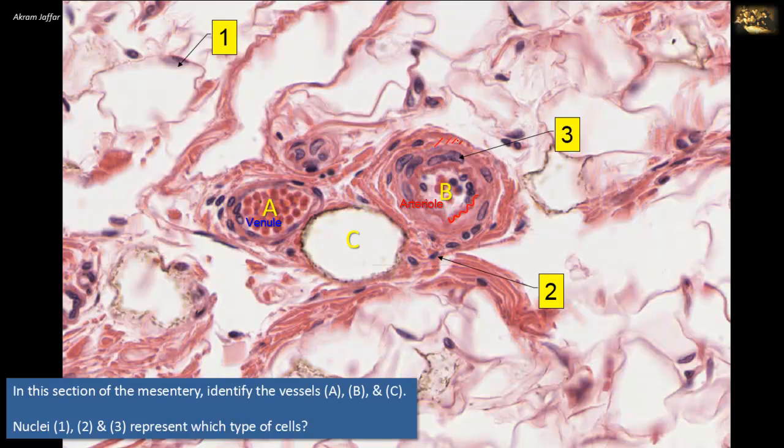The vessel C has the thinnest wall in comparison to its lumen. It is, in fact, a lymphatic vessel, although not conclusive, but the absence of RBCs in the lumen of this vessel in comparison to the adjacent arteriole and venule supports the identification that it is a lymphatic vessel. Lymphatic vessels are easy to see when they are distended. Otherwise, they cannot be seen because of their thin wall. They are easily collapsed during tissue preparation.